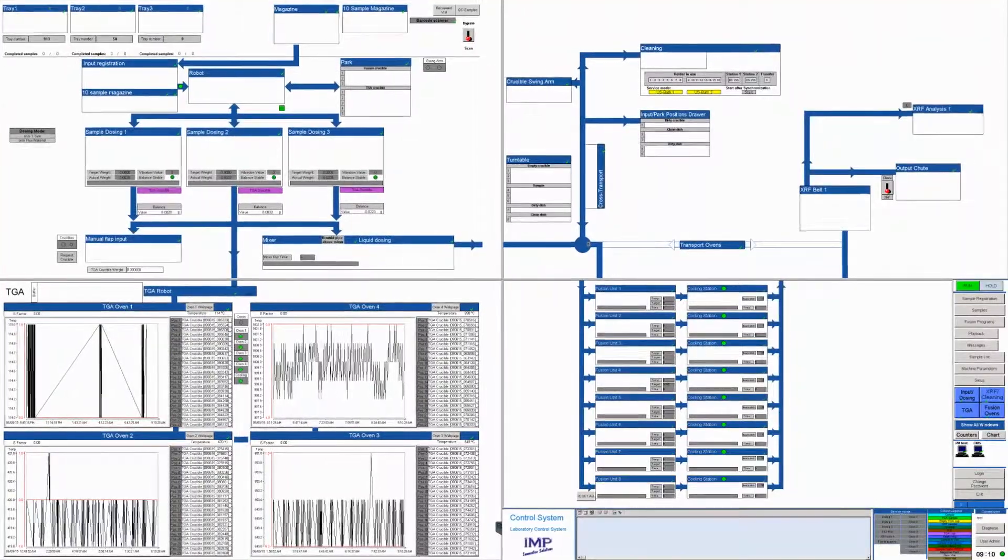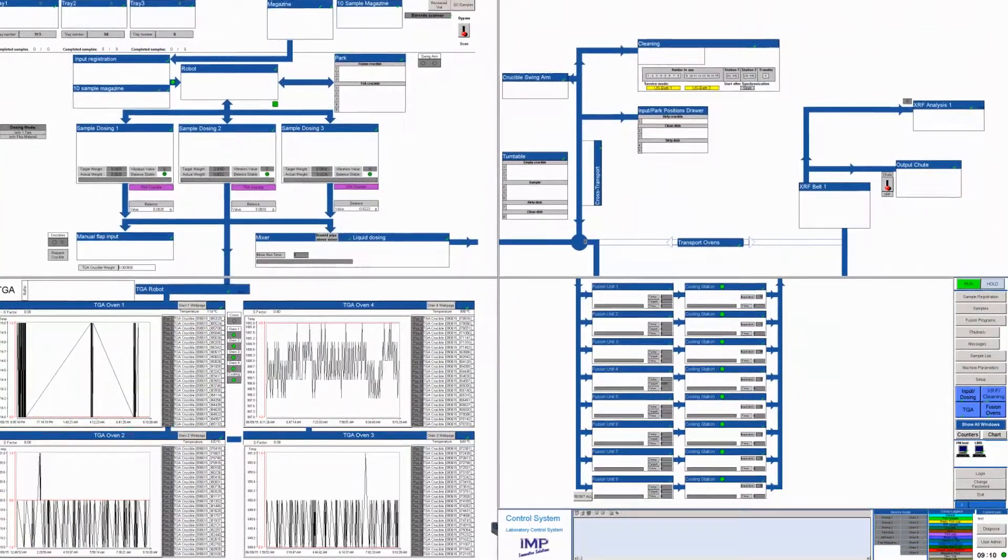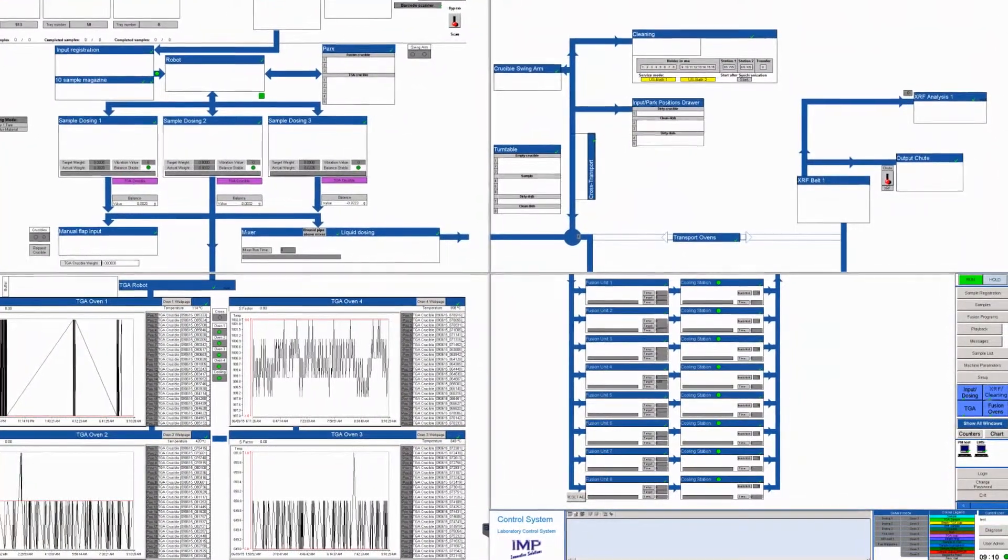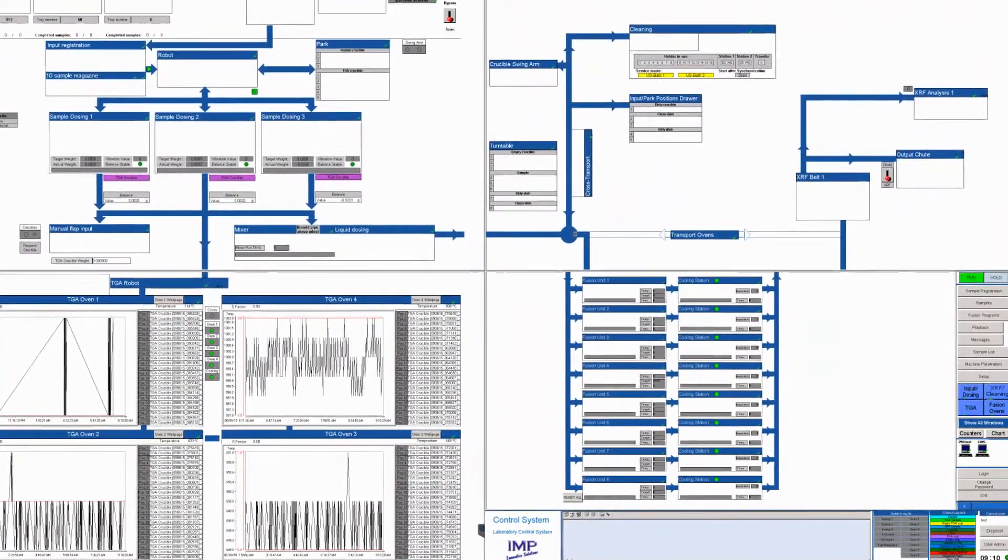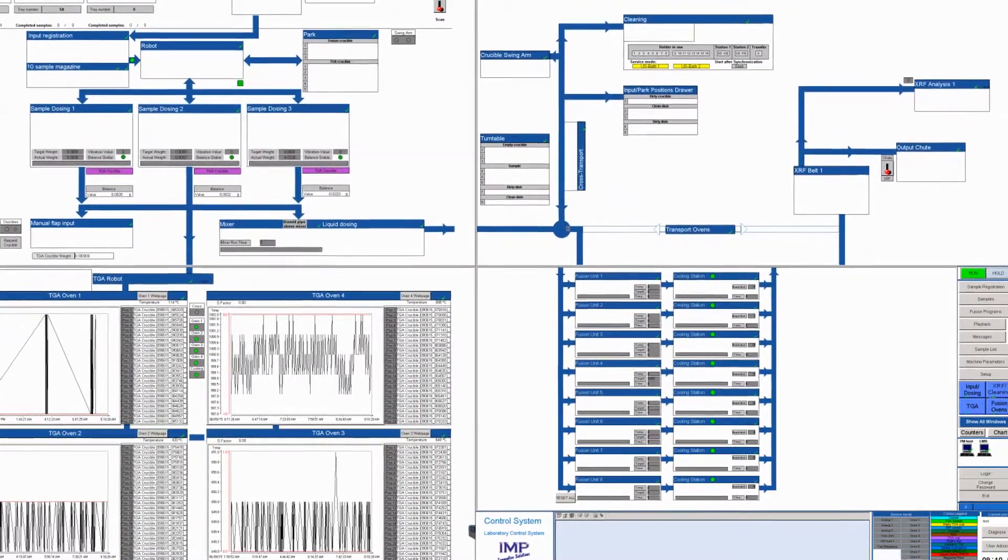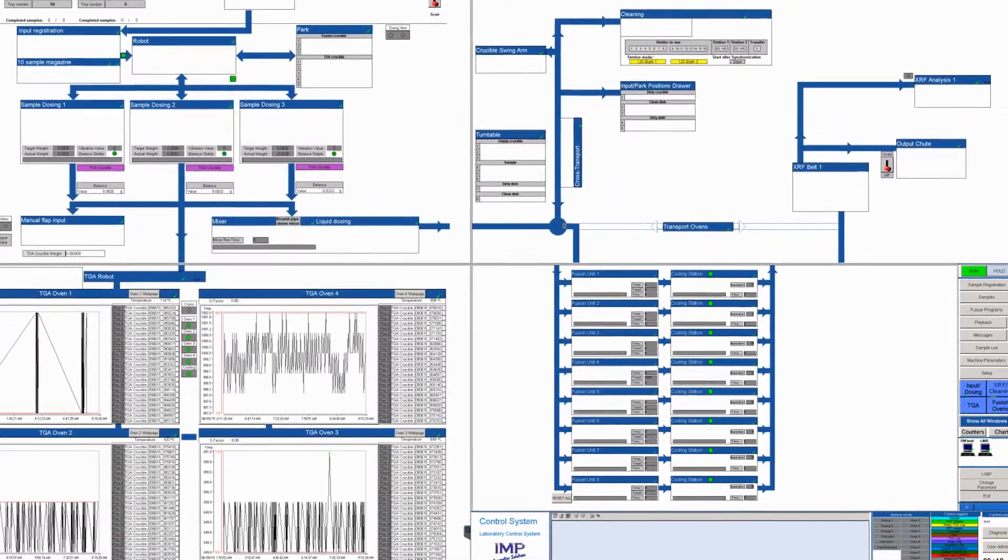The whole operation is overseen by the control room and the laboratory information management system keeps track of the samples as they progress through the system.